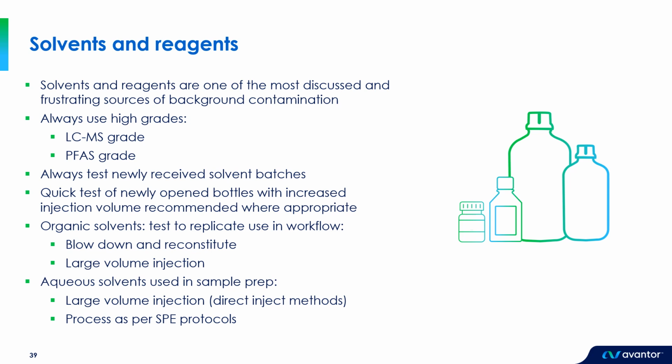So we can either look to blow down a volume of the solvent and reconstitute to replicate the workflow, or we could look again to utilize that large injection volume approach we discussed earlier. Aqueous solvents are a little more involved to test. They're typically used in the sample prep procedure.